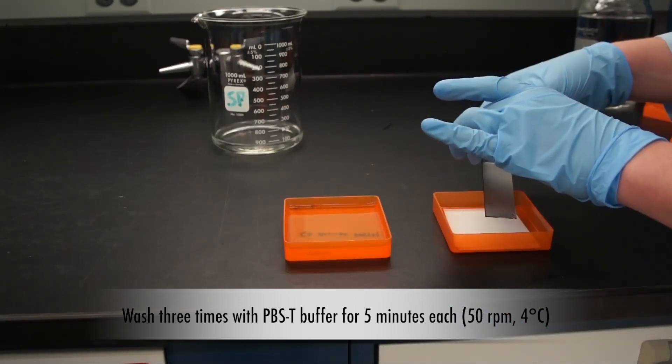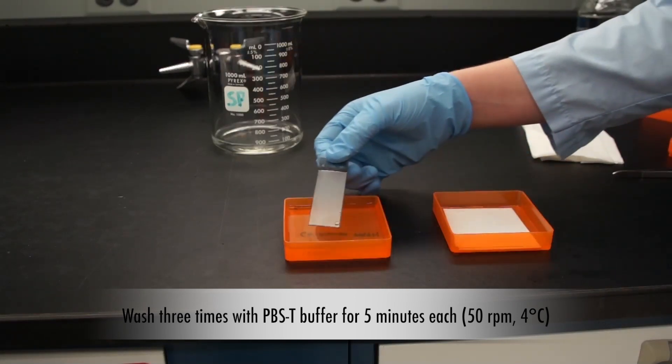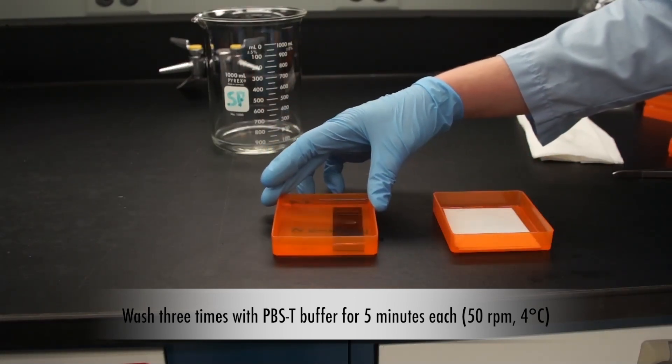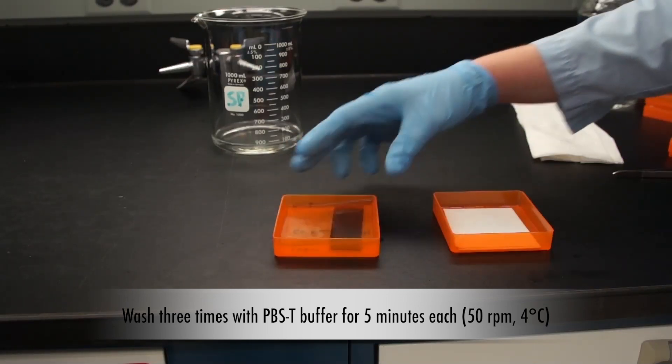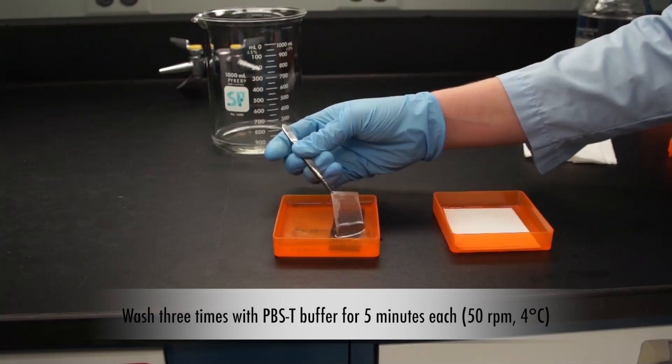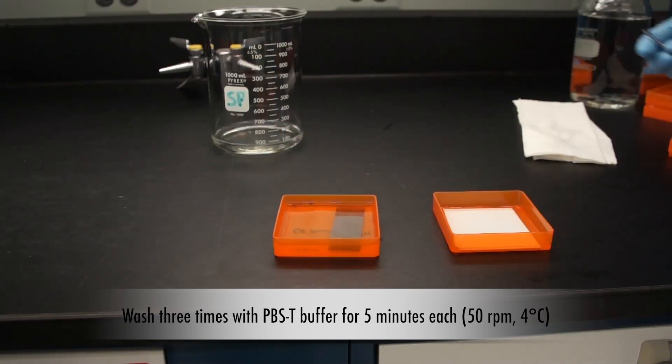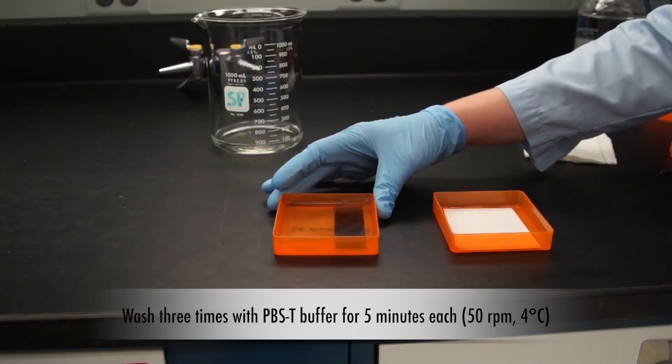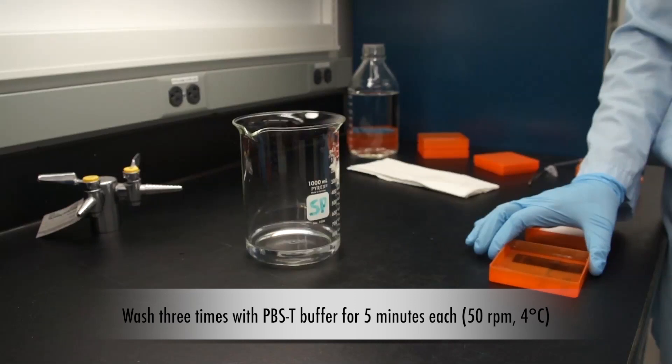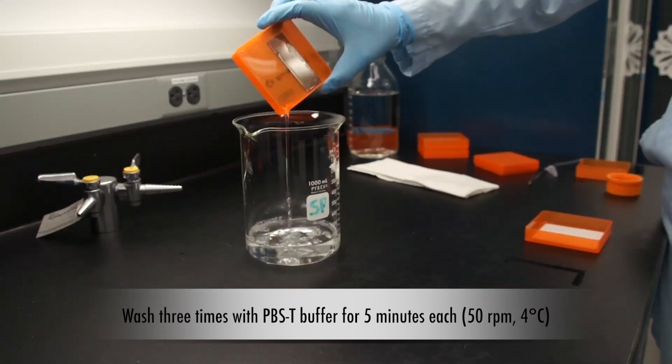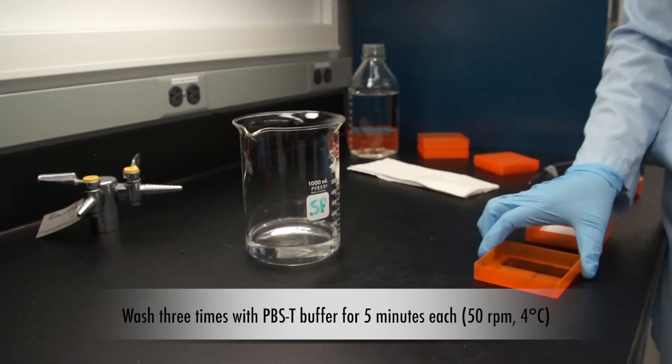Gently drop the slide into PBST buffer to wash the probing buffer off the slide. Shake the slide for 5 minutes at 4 degrees Celsius. Drain the buffer from the chamber and wash twice more with PBST.